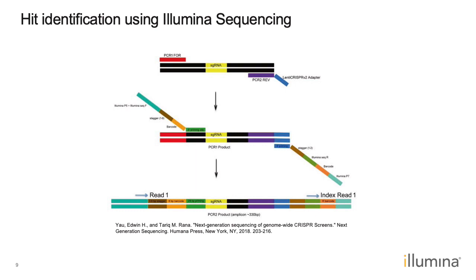Now, because that lentivirus is going to integrate its genome into the host, we are able to effectively design PCR primers that will bind to that lentivirus sequence flanking our guide RNA, and so we won't need to design a unique primer for each guide itself.